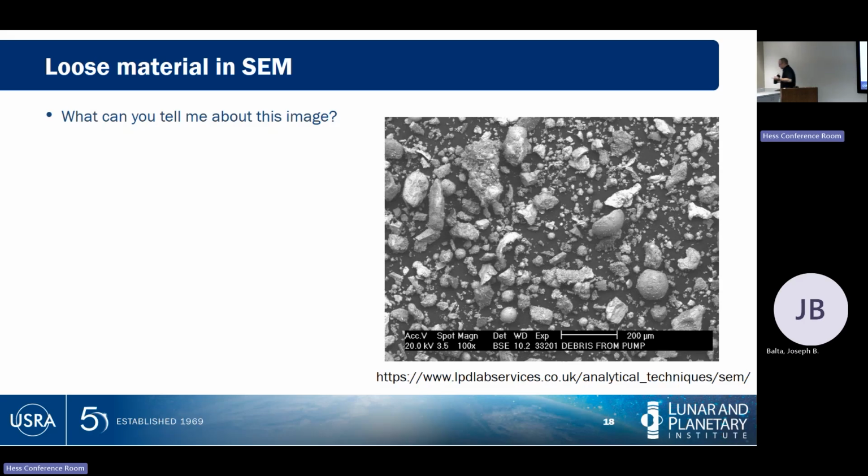Okay? It's a backscattered image on a powder, which means that if we look in some of the down areas and some of the sides, why is this a degraded image right here? Well, we're not focused on it, first of all, but also it's a backscattered image. So if it's at an angle, it may not give us the best response. Okay.